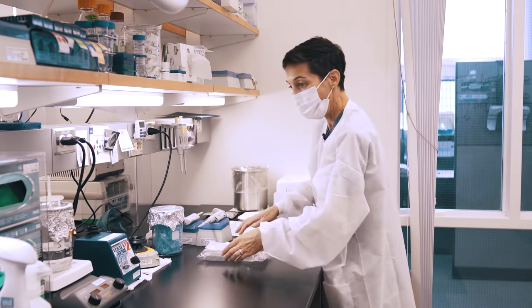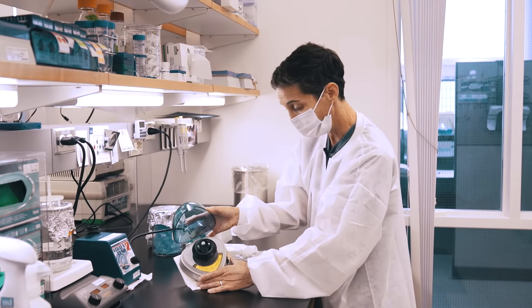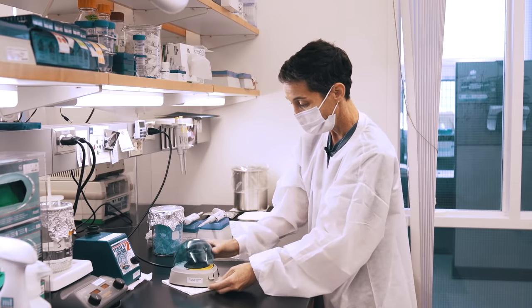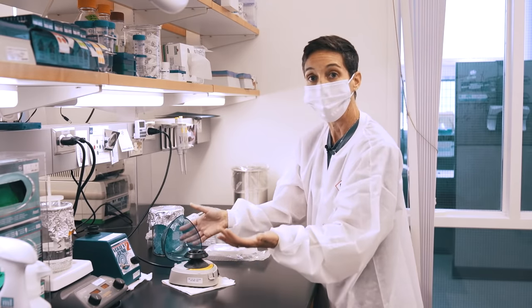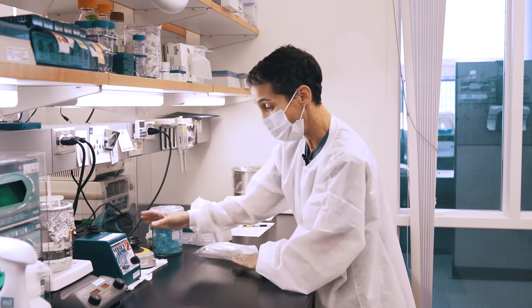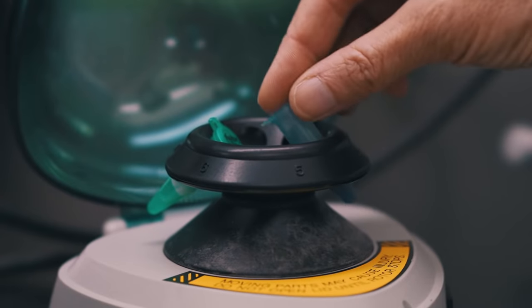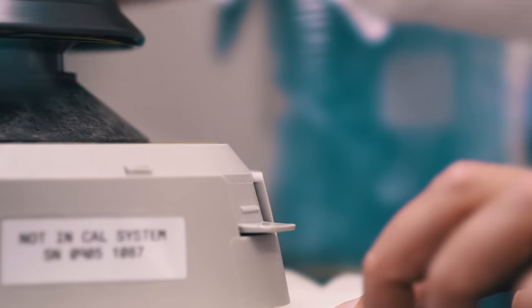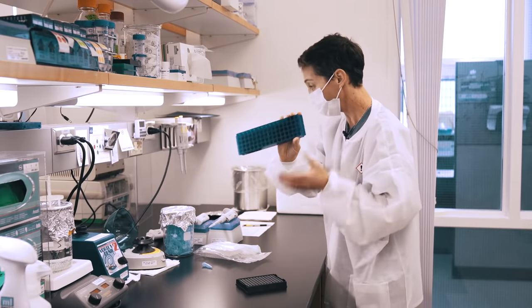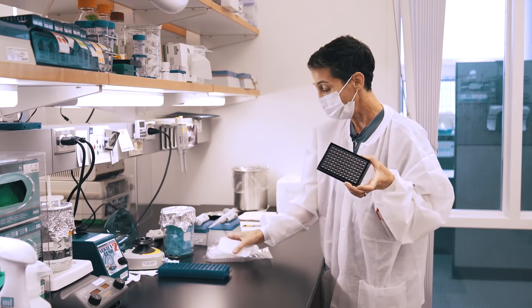We also have a small centrifuge. It holds six 1.5 mil tubes and it doesn't go very fast, but it is good for getting droplets from the inside of a tube collected down into the bottom of a tube and so we use this a lot. We also have a vortexer which allows you to mix a sample easily. After you've mixed it, you'll then want to put it in the microfuge and spin the liquid back down. We have racks that will specifically hold the 1.5 mil tubes and we have racks that will specifically hold the microtiter plates. So that's it for the equipment and next we will start getting ready to set up the reactions.